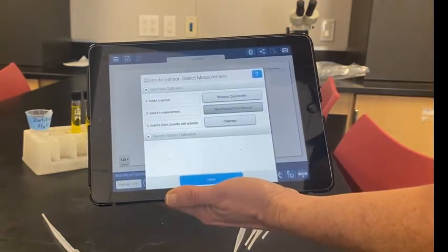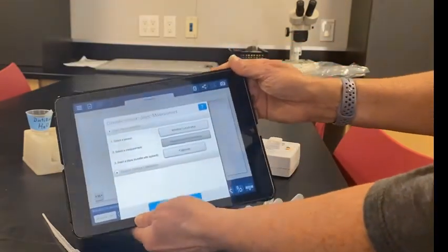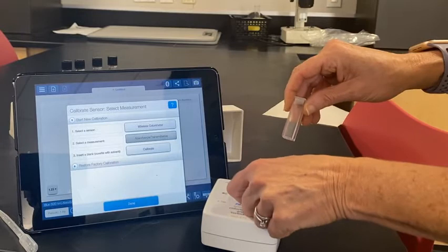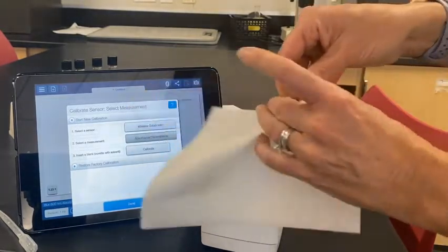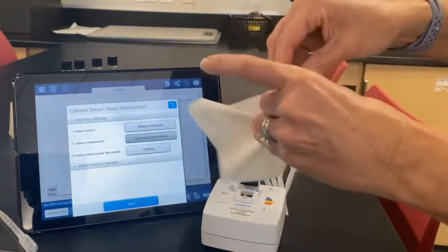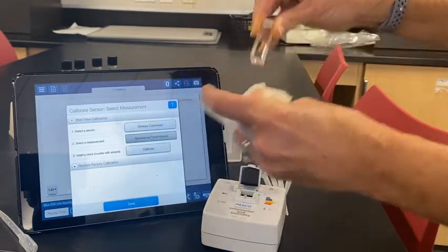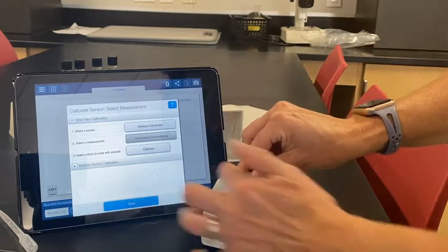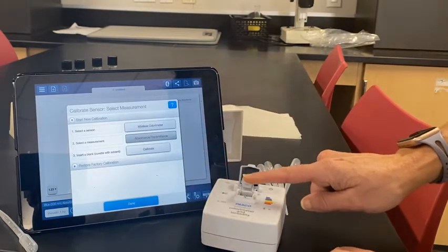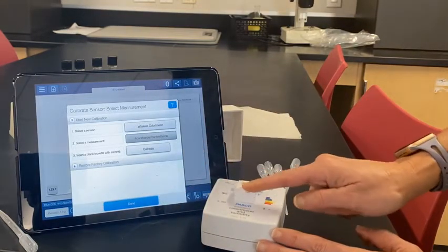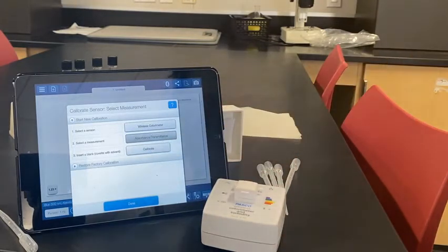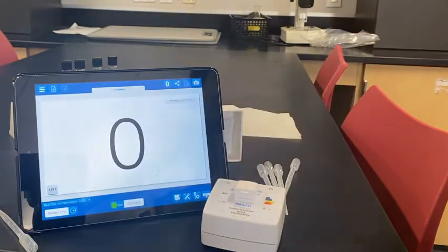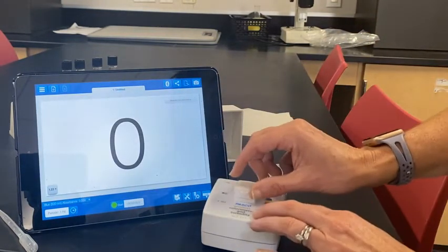To calibrate the sensor, this is what you're going to use your distilled water for. Open the colorimeter and wipe down the distilled water cuvette — make sure there are no smear marks, and that the clear sides allow light to go through. Give a little push, then hit calibrate. When the check mark appears, click done, and now it is ready for all the other readings.